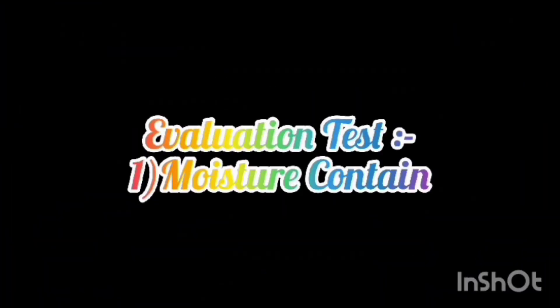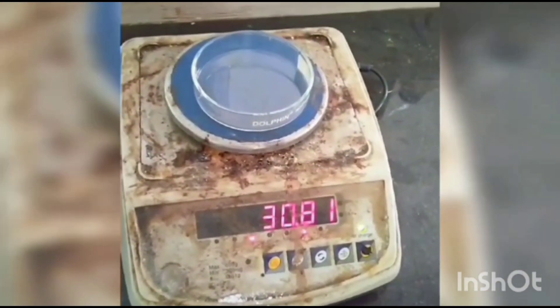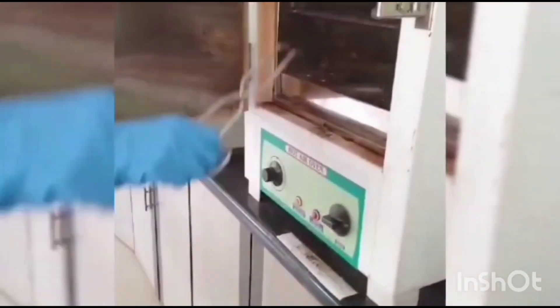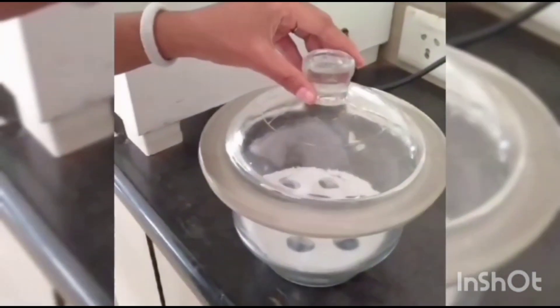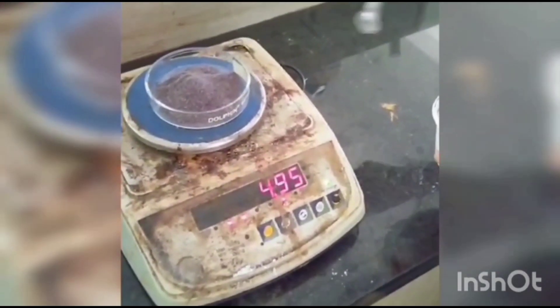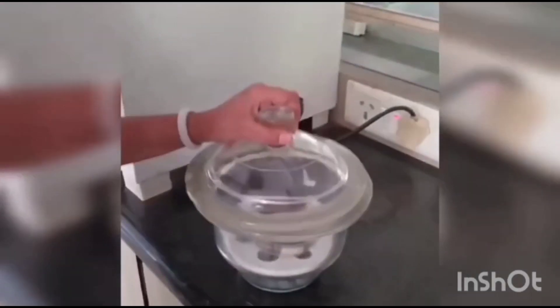Evaluation tests for the tea bag. Determination of Moisture Content: Place a clean glass petri dish in the oven and dry at 105 degrees Celsius. Take out the petri dish, cool in a desiccator, and note the weight. Take 5 g of sample in the petri dish and note the sample weight. Place inside the hot air oven at 135 degrees Celsius. After 50 minutes, remove the petri dish, cool in the desiccator, and take the final weight.